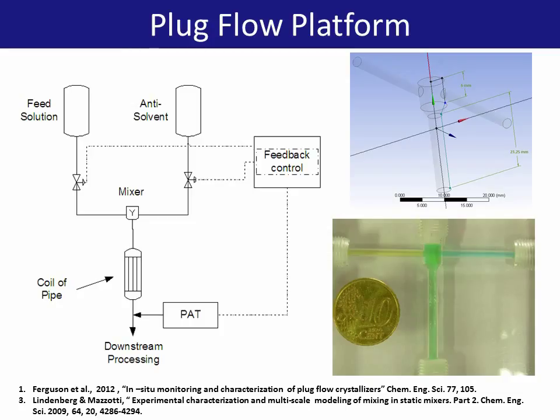The final thing to note is the level of productivity. Despite having a volume of approximately 33 milliliters, the plug flow device is capable of producing 60 kilograms a day of dry, isolated benzoic acid product, essentially providing industrial scale pharmaceutical production with lab scale equipment.